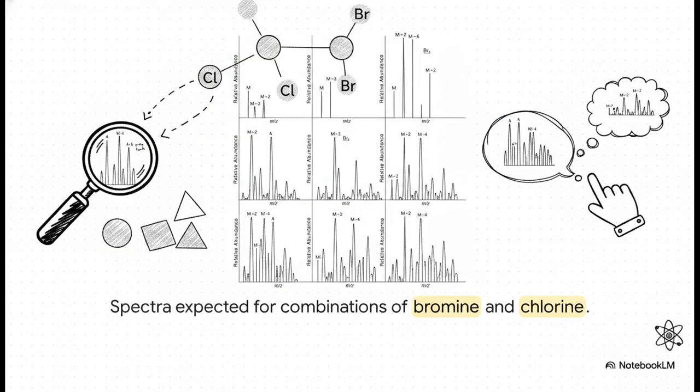Now, when multiple halogens decide to join the party, this pattern recognition becomes practically a superpower for chemists. When you mix 2 bromines, or maybe 3 chlorines, or a wild combination of both, the math just compounds. You can visually identify the distinct clusters of M, M+2, and M+4 peaks, depending entirely on the exact mix of those atoms. By just glancing at the shape of these peak clusters, a trained chemist can immediately go, yep, we have a molecule with exactly 1 chlorine and 2 bromines.